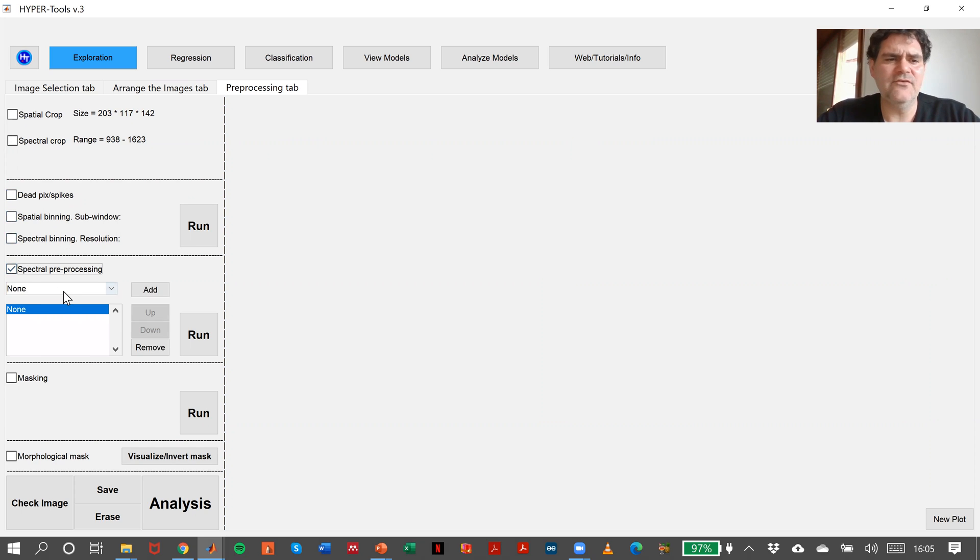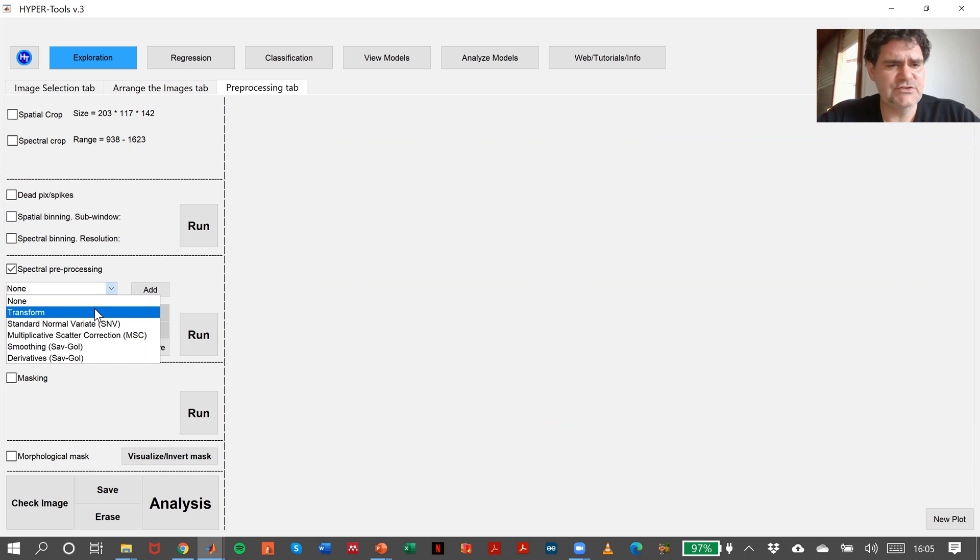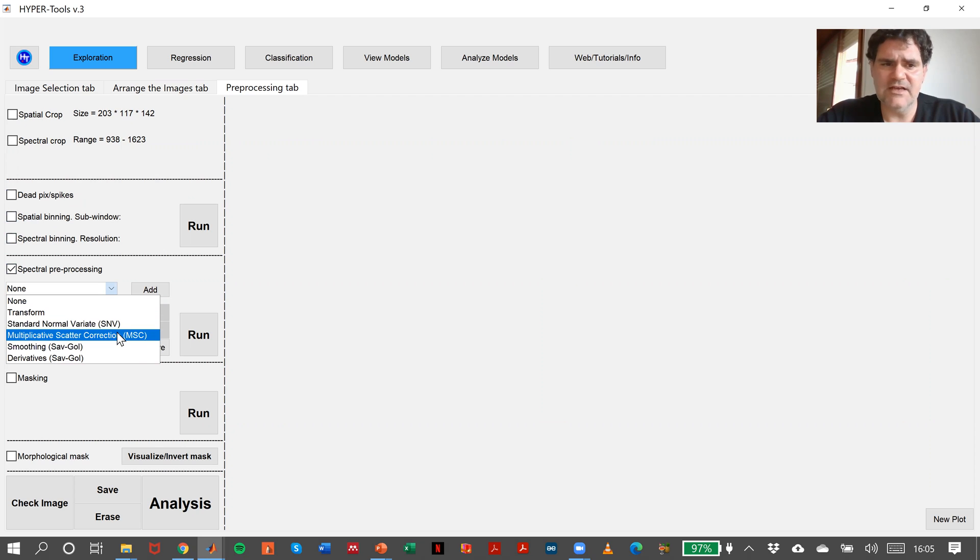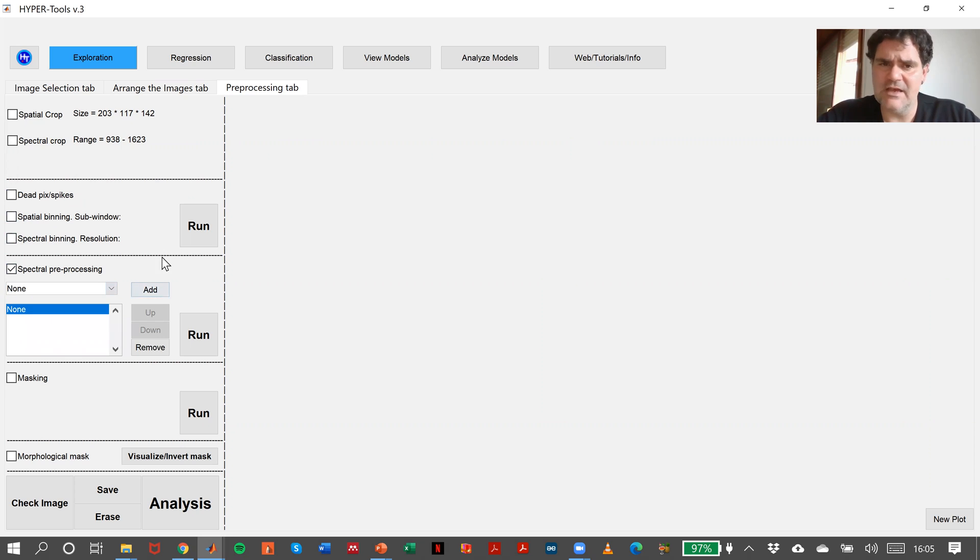We have the classical auto-scaling and Kubelka-Munk transformations, standard normal variate, multiplicative scatter correction, smoothing and derivatives that we can use in the order as many times as we need.